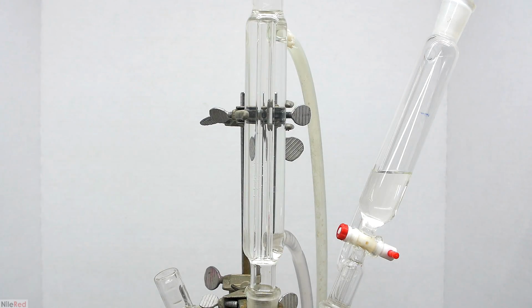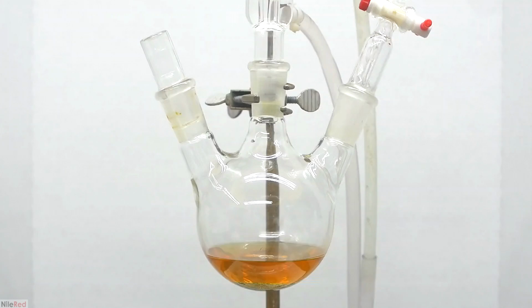I then attach the hoses of the water circulator to the condenser, and I start cycling some ice-cold water through it. It's pretty important to use ice-cold water because as the reaction proceeds, the ether is going to boil, and if the condenser isn't cold enough, the ether won't condense and it will escape out the top. In the flask, before starting any reaction, we have an initial mixture of diethyl ether, magnesium shavings, and iodine.